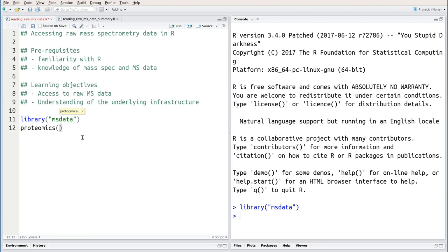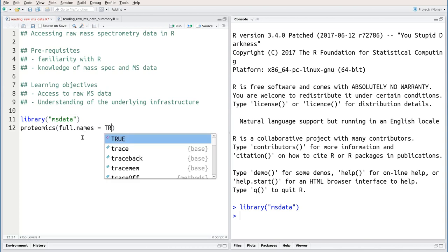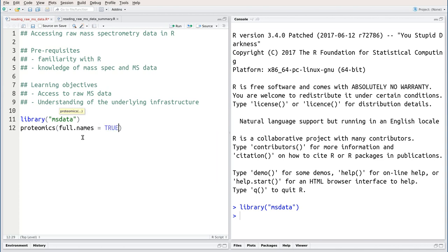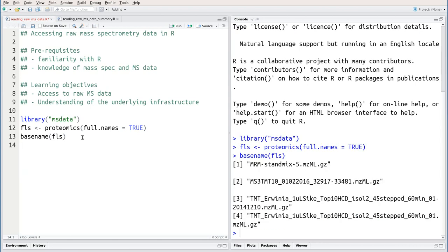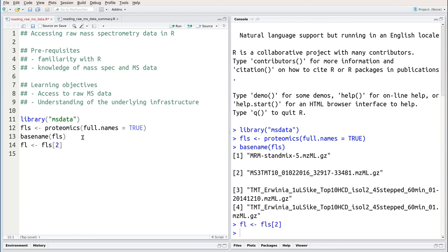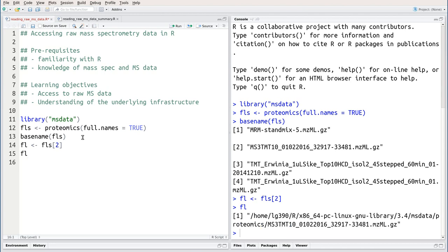We're going to start by using the proteomics function, and by setting full names to true, it will return the full path to four example files. We're going to concentrate in particular on the second one and create an FL variable that contains the full path to this ms3tmt10 file that we are going to use.